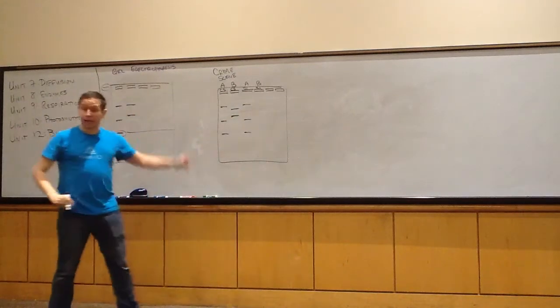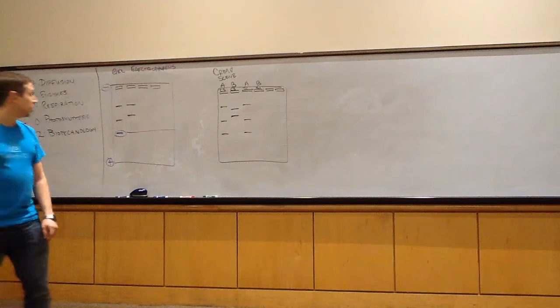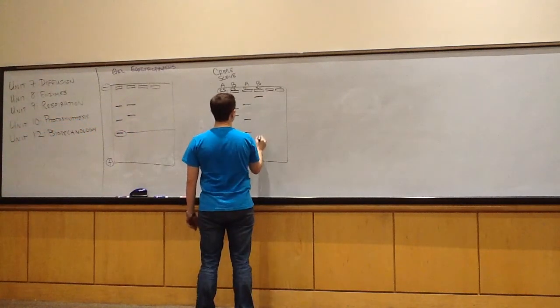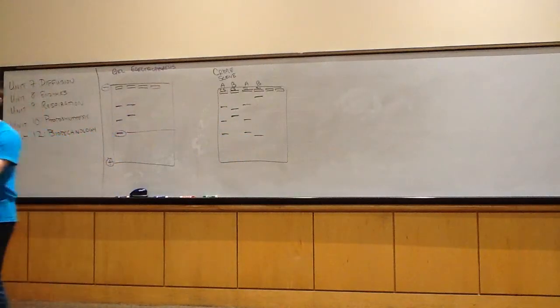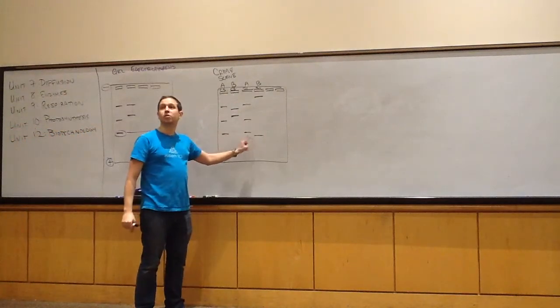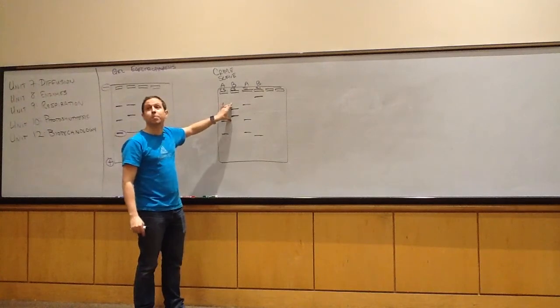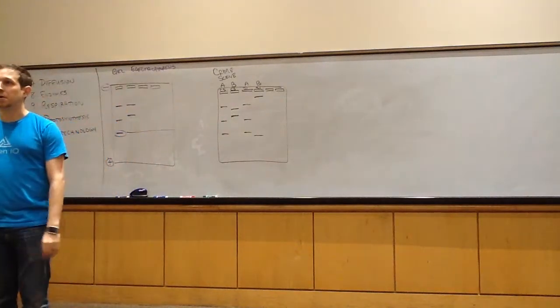Now right now, it looks like suspect 1 might be the guilty party. But let's say that for the second enzyme, enzyme B, his DNA looks like this. Did suspect 1 do it? No. Even though his or her DNA looked the same when digested with enzyme A, because we get this big difference with enzyme B, that person is not the guilty party.